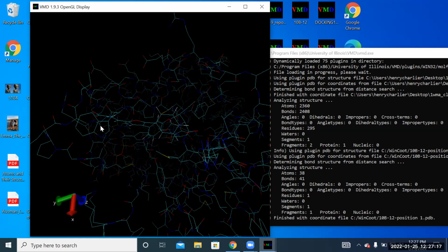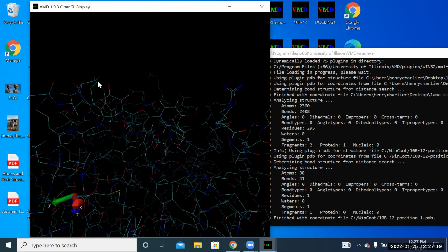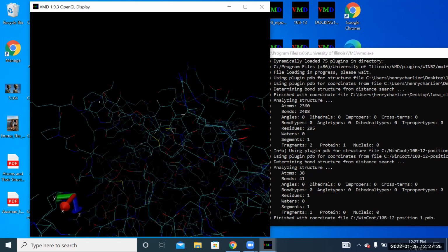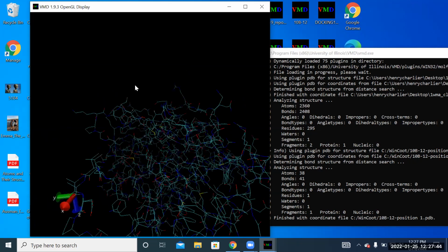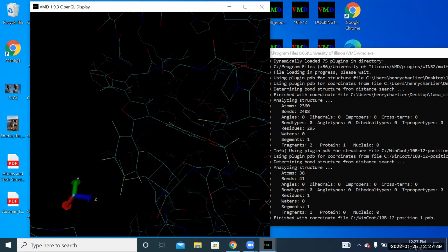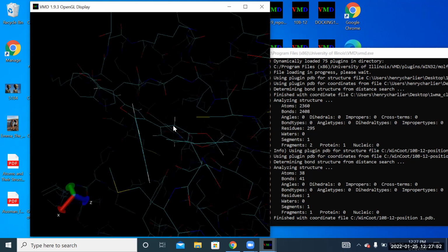So you've got to fill them in your head, remembering the structures of the amino acids. Oh yeah, this is a phenyl ring that has resonance, conjugated double bonds around here, so you've got to remember where the double bonds are. And then you can count the hydrogens off the carbons, because every carbon has 4 bonds. But when we make our measurements, we don't measure from the hydrogen. We measure from the atom that's attached to the hydrogen to the other atoms.